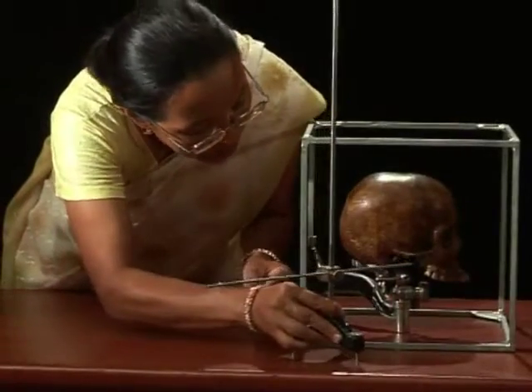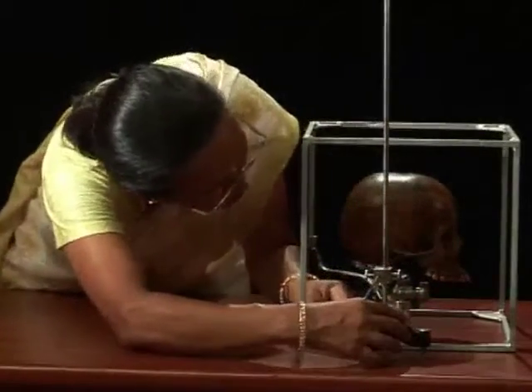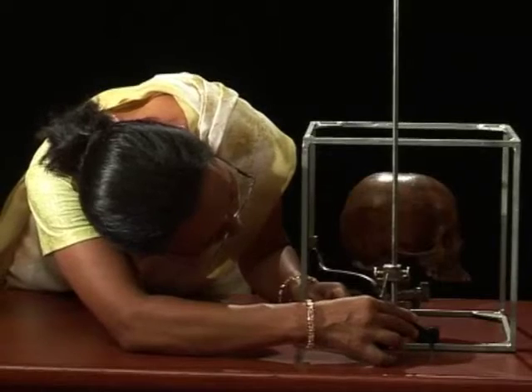With the help of the sliding caliper, the skull so mounted is placed in the Nasion-Inion plane, that is, the Nasion and Inion points are at equal distance from the left side of the metal bar. This should not disturb the FH plane. The skull has to be kept on an FH plane using Martin's horizontal needle.